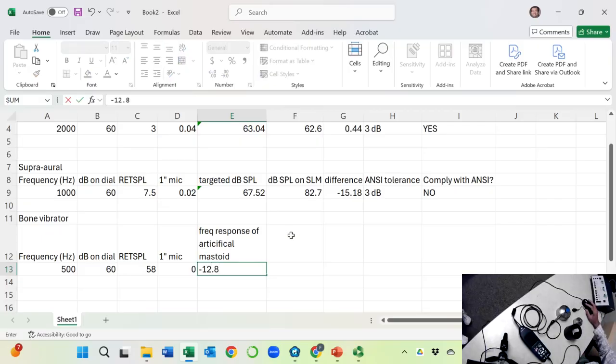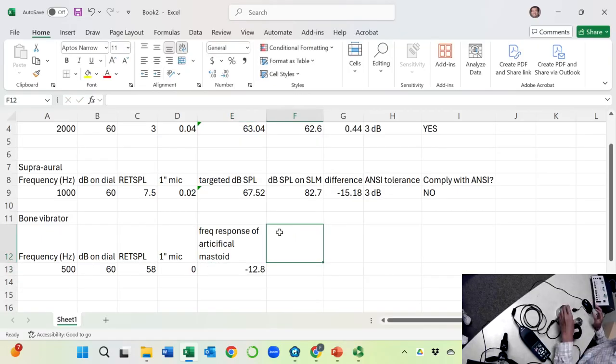Okay. You think that's all for this piece? No. Yeah, you're right, it's not the end. Because it's plastic, we need to consider the temperature and humidity.